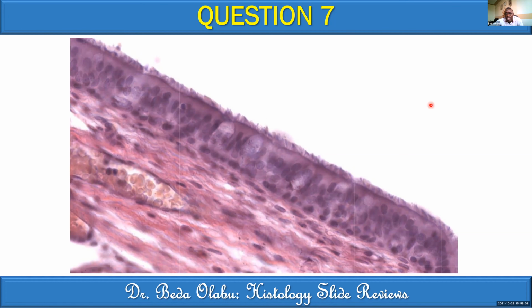So here I'm confident about the cilia. We can see the cilia there. We are not seeing that double line discrete that we saw for microvilli, but yes, you still see something. That's how cilia looks like. Why are we saying this is pseudostratified?